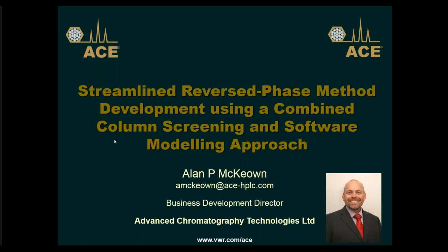Welcome everybody to the third in this series of chromatography webinars discussing different aspects of chemistries, method development, and how we can optimize and speed up our method development approaches in our labs. So this third talk today, as Ian has mentioned, talks about how we can use different types of column screening, but then push our separations further and potentially faster by using software to help us in our approach.